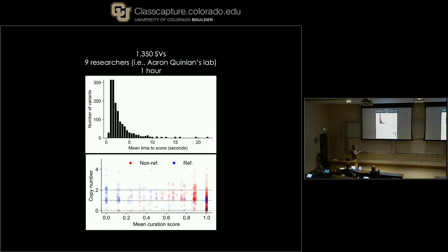And then you also see up here that SVTyper said that they're, wait, hold on. Yeah, then there's also issues where the copy numbers are off because we said that clearly there does not exist a variant here, but we see that there appears to be copy number 1 from CNVnator. So we actually can control for some of the weaknesses that exist for how we judge whether or not a structural variant is real or not. And in fact, the 2 seconds that you spend actually looking at the variant is typically less time than SVTyper or CNVnator spends running their models on that data.